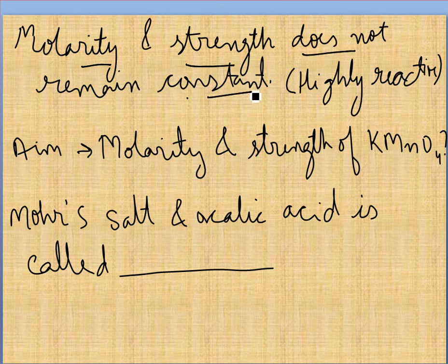It changes. When we make KMnO4, after some time, its strength and its molarity change. It is highly reactive. It reacts with air, impurities, and its strength will change.